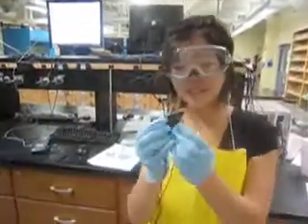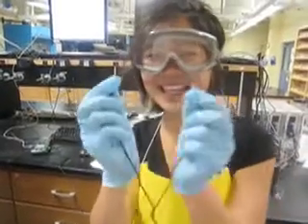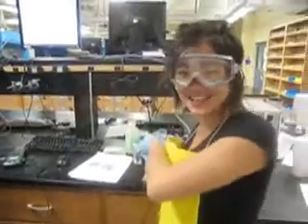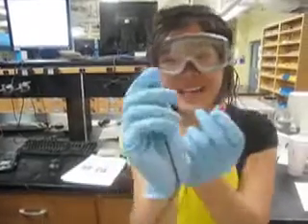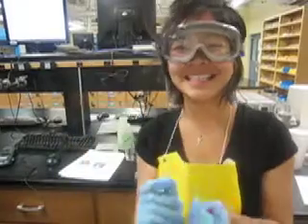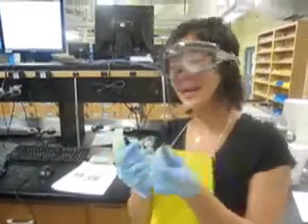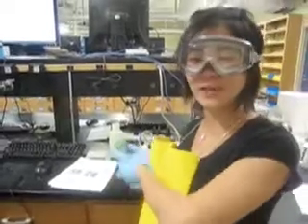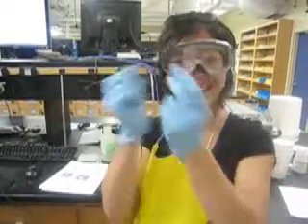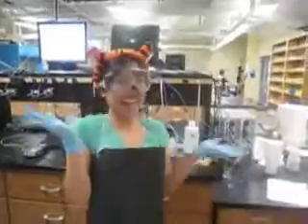Wait, you have to determine the voltage by touching the lead to the electrodes. Holy mackerel, they look like alligators. They have teeth, but they're just alligator clips. If you do it right, you should have a positive voltage. If you're wrong, then switch it. And now we have a battery!